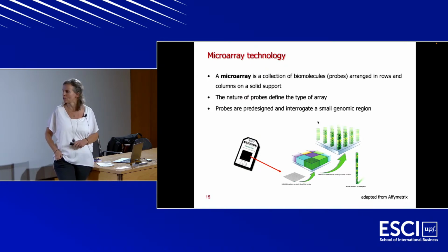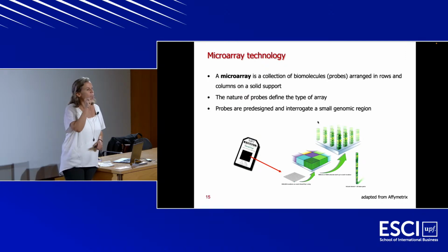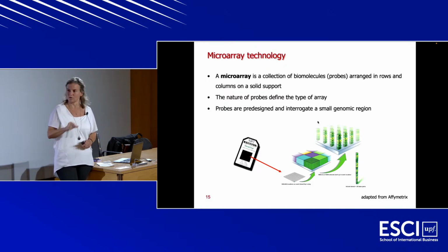Can be a patient or not. Okay? And the probes need to be pre-designed in each of the different spots that are here. So this is like a matrix with different spots. Each of these spots has pre-designed probes, and this is targeting a specific area in the transcriptome, in a specific gene. So by studying all those areas, we can study a complete genome just by targeting specific areas.